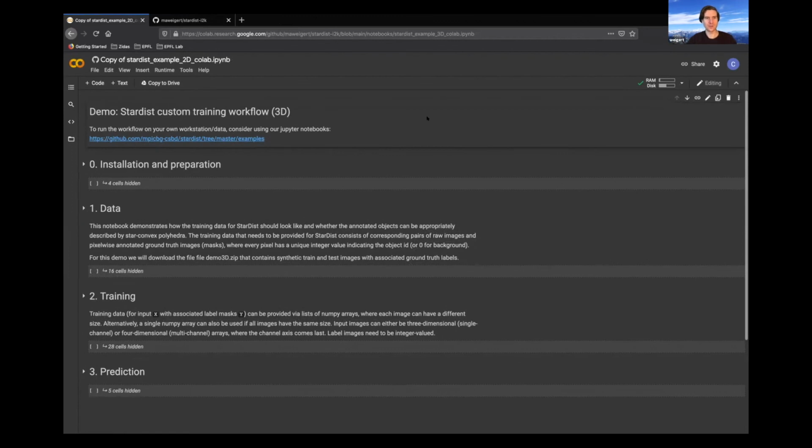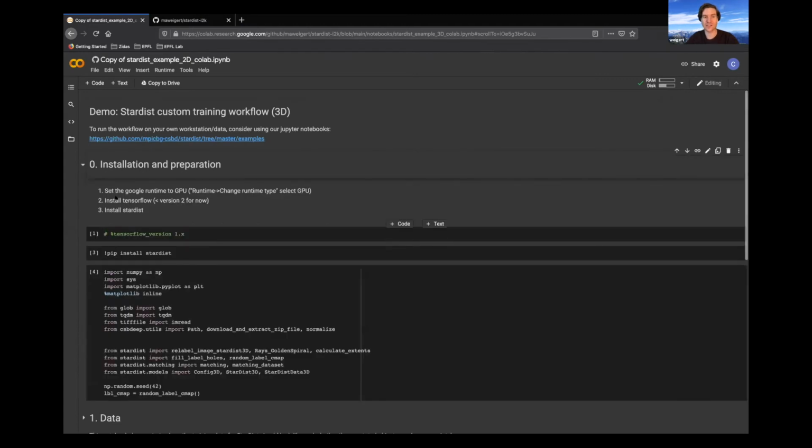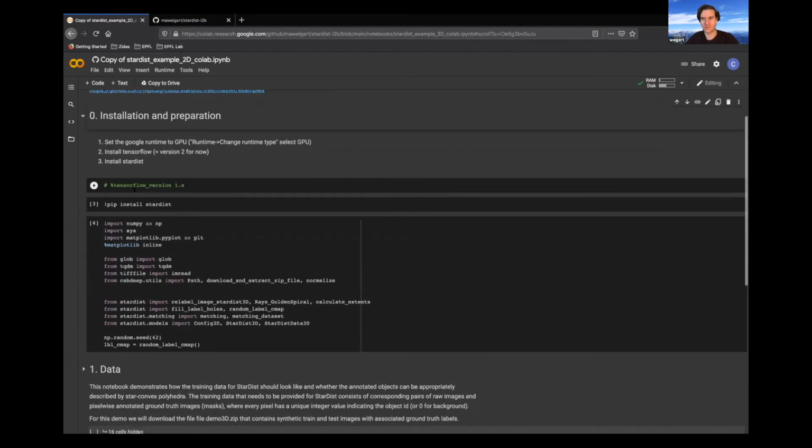Okay. So everybody who hasn't used Jupyter Notebooks before? Raise of hands. Okay, so just for those who haven't used them, Jupyter Notebooks are just a sequence of Python steps. So each cell contains code, and you can run it by just going to a cell that is runnable, and it looks like this, and it has a little play button on the left. And you just go in succession and follow each code cell and run it, and you'll see how it goes. But essentially pressing this button will run the code that is contained in this code cell. And if you click on those little buttons to the left, it will expand and show you what part of the code each cell corresponds to, right?